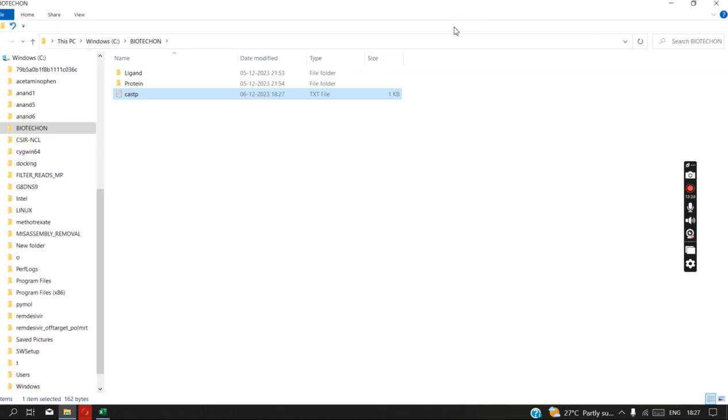In today's class we will see the further steps, how I can use this information for predicting the grid file and all that. And to explore more about the protein, I will be showing the Discovery Studio tools, how they are very helpful for finding binding pockets, and more exploration can be done using Discovery Studio, which I will show you in today's class.